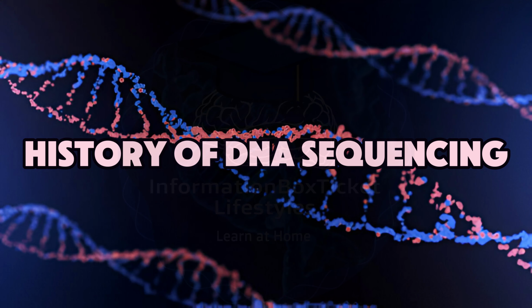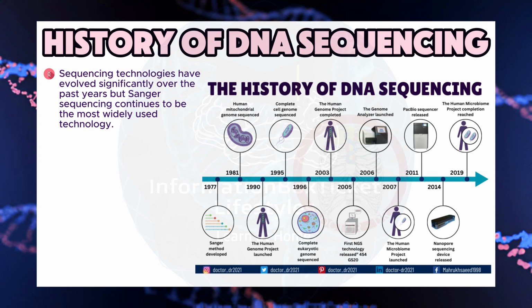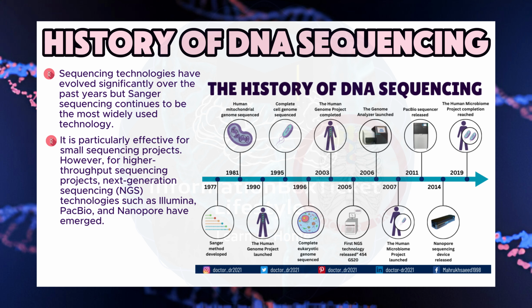The history of DNA sequencing. Sequencing technologies have evolved significantly over the past years, but Sanger sequencing continues to be the most widely used technology. It is particularly effective for small sequencing projects. However, for higher throughput sequencing projects, next-generation sequencing, NGS technologies such as Illumina, PacBio, and Nanopore have emerged.